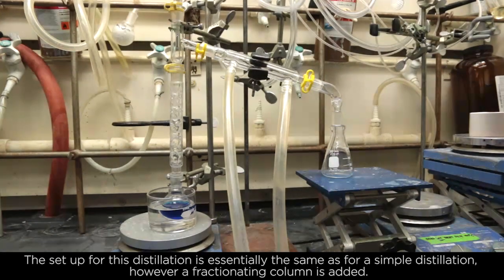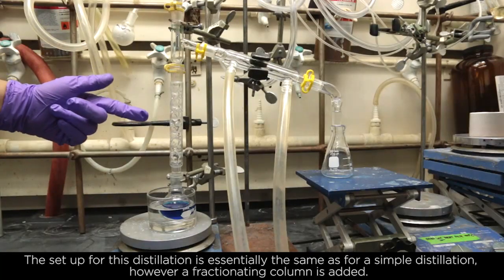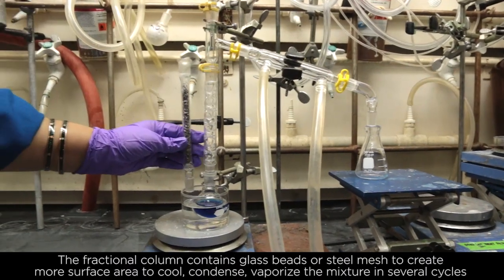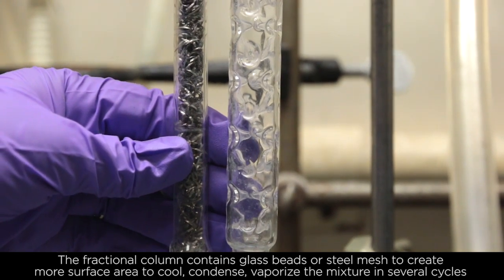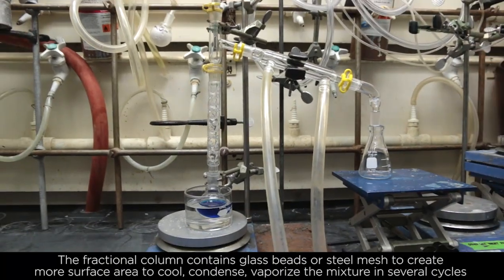The setup for fractional distillation is essentially the same as for simple distillation. However, a fractionating column is added. The fractionating column contains glass beads or steel mesh to create more surface area to cool, condense, and vaporize the mixture in several cycles.